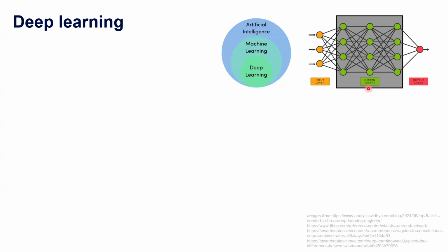In general, a neural network can be thought of as a kind of black box that takes some input data and learns within, creating many connections to learn and recognize patterns and structure of the data. Once the network has learned these patterns, we can use it to predict the outputs for new sets of similar data. So it's input and output, but we have to train the model, essentially.